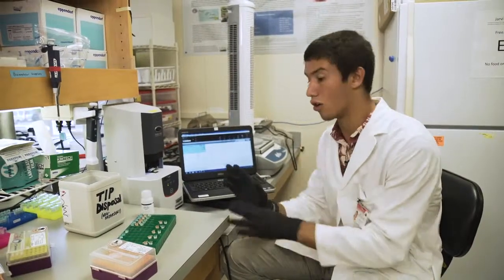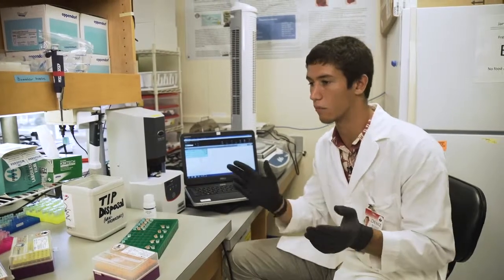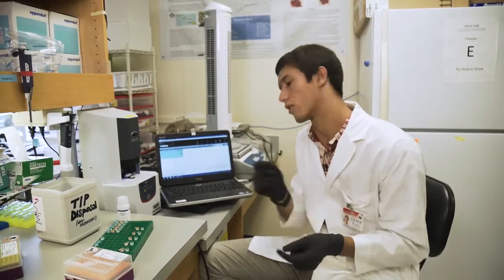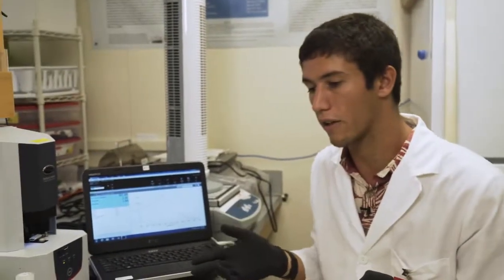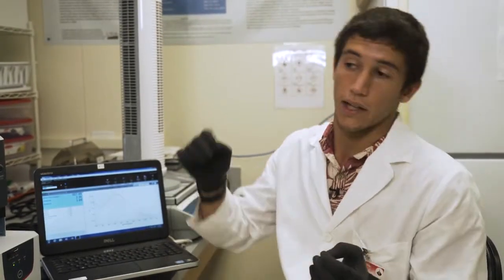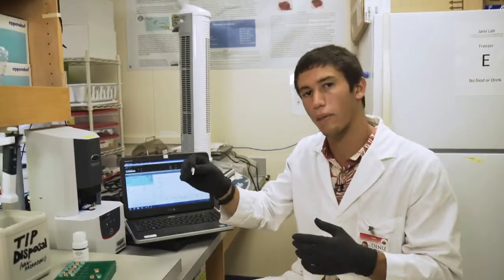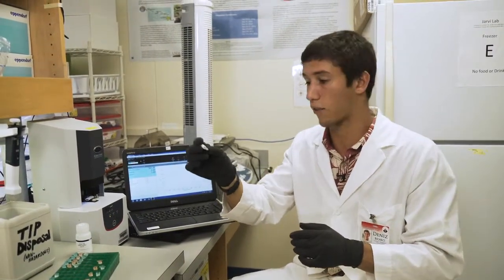So this is all the DNA of the slug. If you take a piece of DNA from any part of the slug, you'll get its full genome. And same thing with us, same thing with just about everything. You can do a simple mouth swab and you'll collect a whole bunch of DNA and probably some bacteria DNA and other things too. What we do with these slugs is, you can't look at a slug and tell whether or not it has rat lungworm. So part of this is we take the slug that we've trapped and we digest it and we get all the DNA, including, if there was rat lungworm in that slug, the rat lungworm DNA. So the next step after this is the PCR.